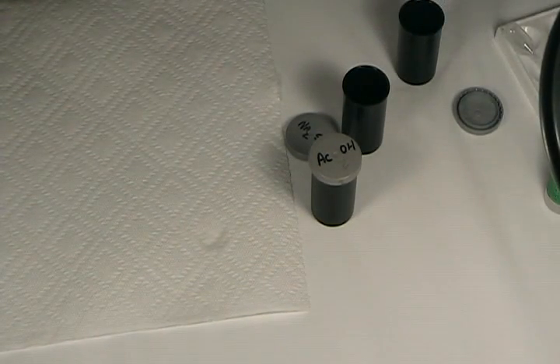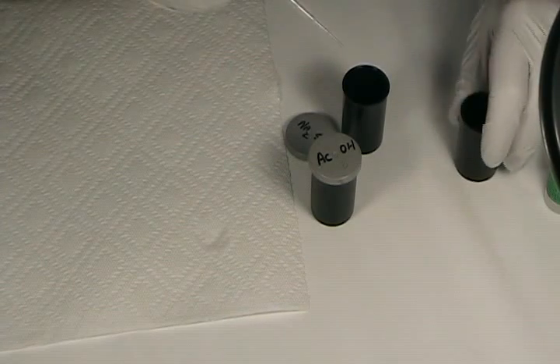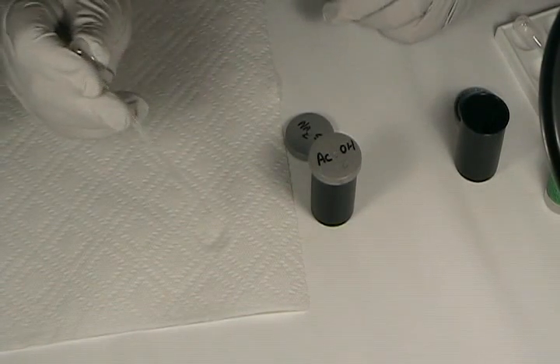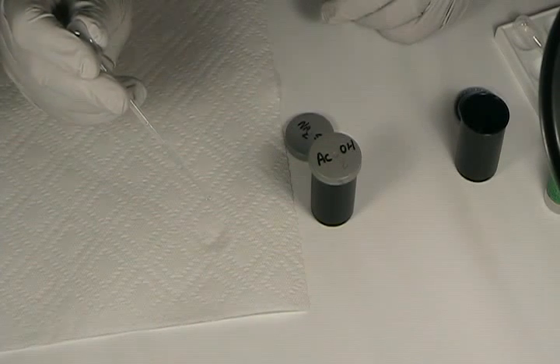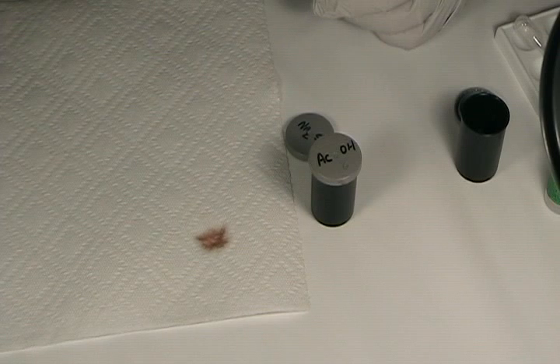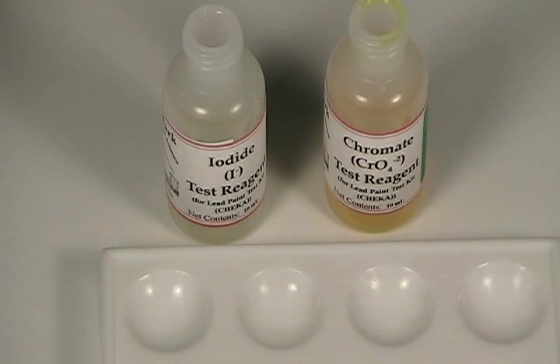Let's see how it reacts to our sulfide reagent. That has some serious lead in it. Based on the sodium sulfide tests, we suspect that this paint sample may contain lead, but we don't know for sure, because the sodium sulfide reagent can react with other materials to form a very similar brown stain.